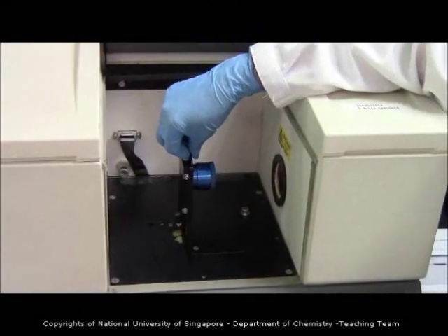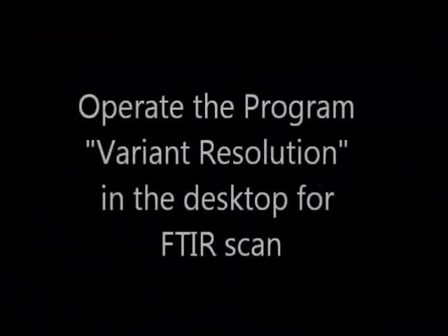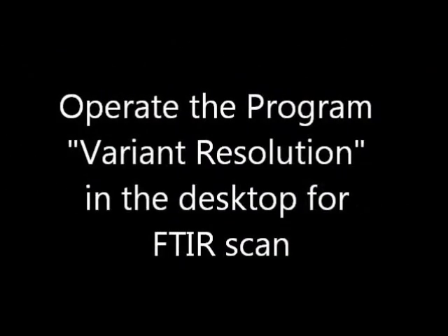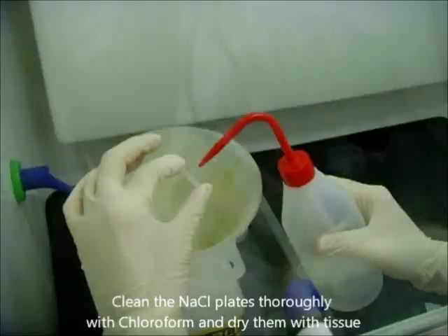After putting the sample holder into the FTIR machine, you can click on the desktop and operate the program — Variant Resolution — for the FTIR scan. After the scan, remember to remove your sample holders from the machine, clean the plates with chloroform, and return them to the oven.